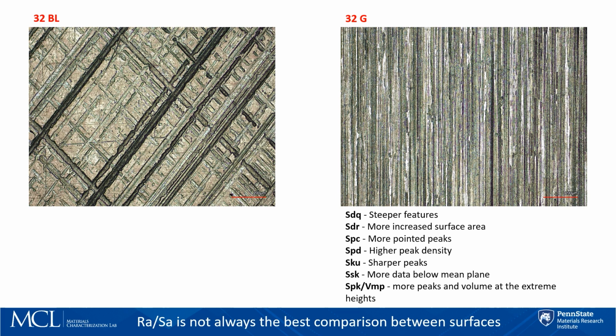So this concludes my talk on what is the surface roughness of my sample, and I hope I've shown that it really does depend on exactly how you've measured it, what technique, and the conditions you've run that technique at, and that it's not always the important question. Roughness sometimes is just not useful in describing the difference between the samples that you are considering, and alternative texture parameters exist for a reason. Thank you.